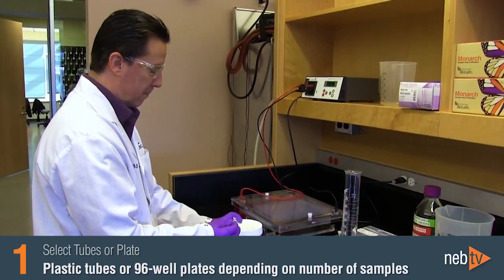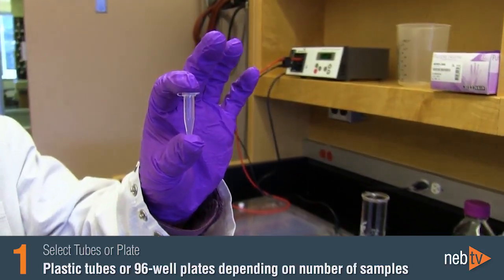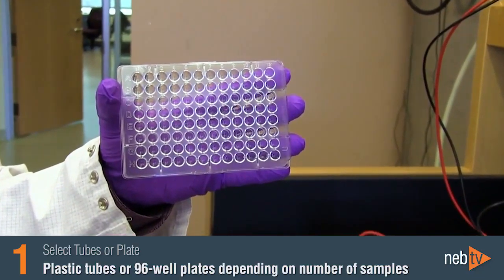To prepare your DNA ladder and your samples, you'll need some small plastic tubes. 500 microliter tubes work well. Because we often load a lot of samples at once, we use a 96-well plate.